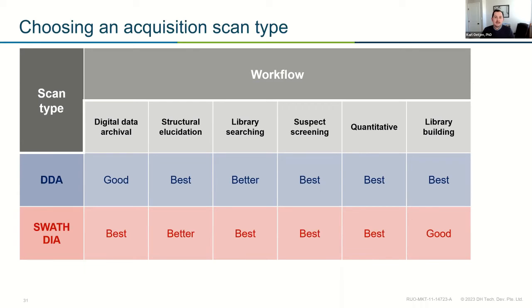If you wanted to do quantitation, as we discussed before, you can just use either of these approaches. We're using that MSMS data in the same way, so we don't have to worry about whether it's SWATH or IDA. It's going to be highly quantitative either way. The only difference from the MRM experiment I showed earlier is that there we can optimize for a certain collision energy. Here, since we aren't sure what we're going to see, we have our known unknowns, we don't have those optimal collision energies for the utmost sensitivity.